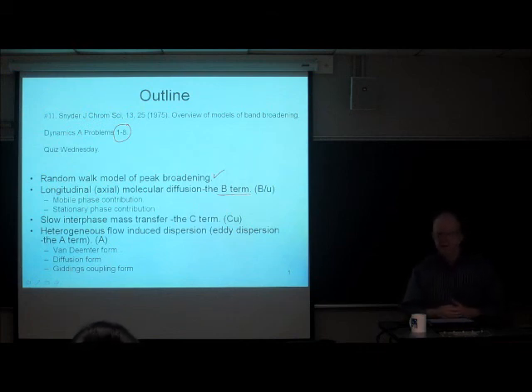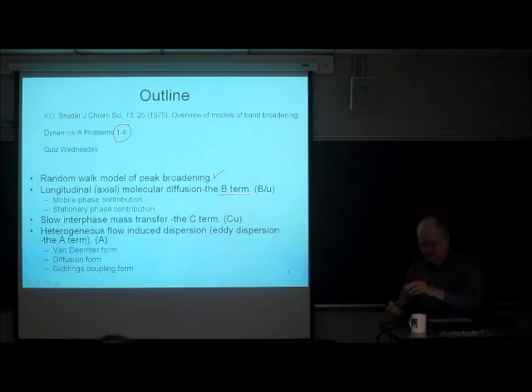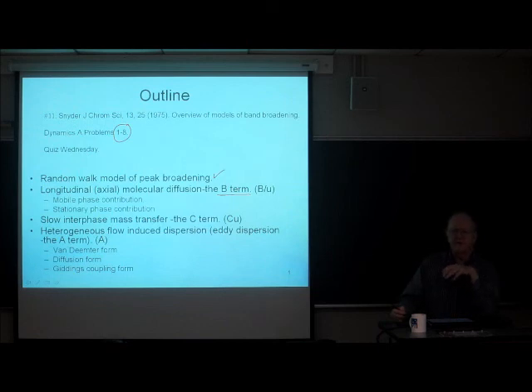So a few years after the Van Deemter equation was put out, some other people came along and said, we don't agree with all of the assumptions that Van Deemter and his crew made, and we believe that there's a substantial, if not dominant, diffusional contribution to eddy dispersion. And so there was a second approach developed, second subcase, if you will.